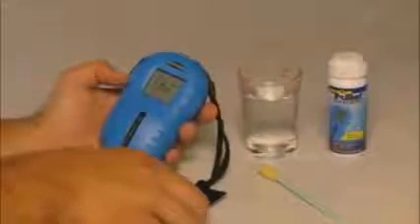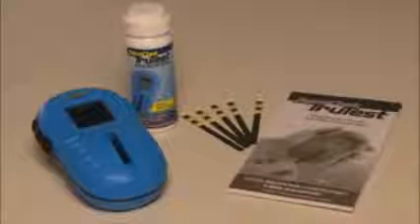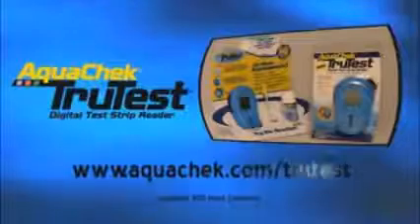If used in intense sunlight, position the light shield over the strip window to prevent interference from stray light. Afterwards, remove your test strip and clean off the glass with a cleaning tool or dry cloth. Please refer to the insert in your TruTest packaging or to aquacheck.com/TruTest for more information.